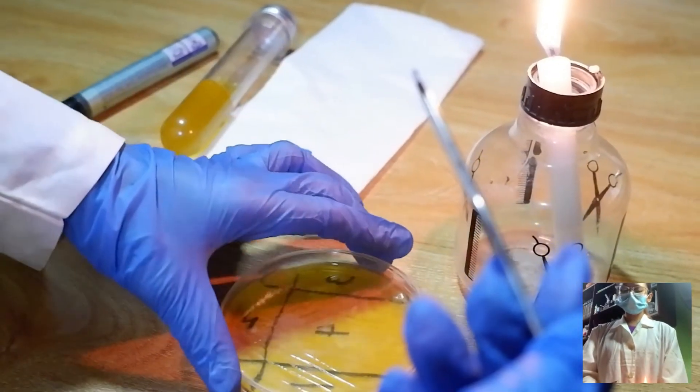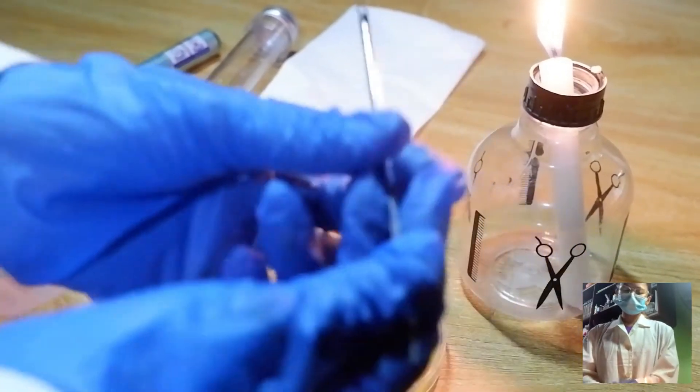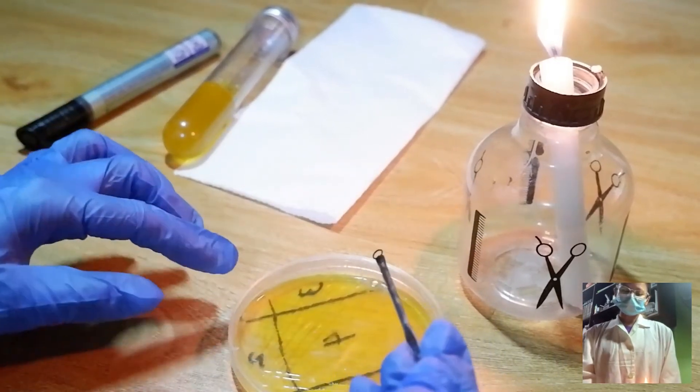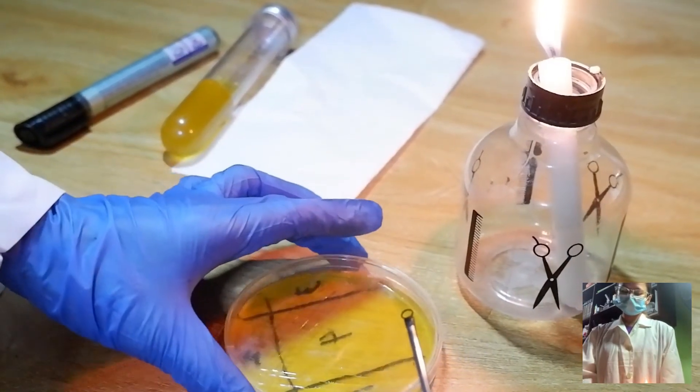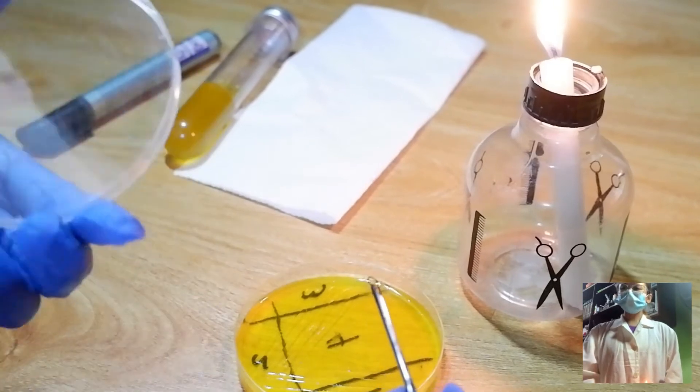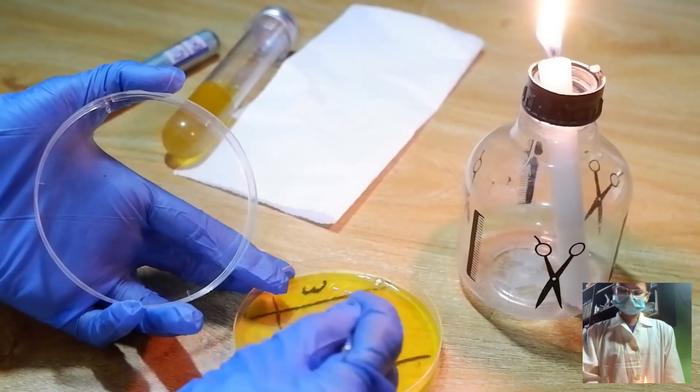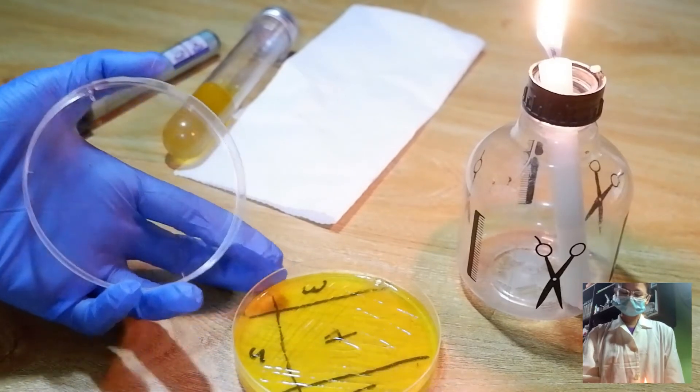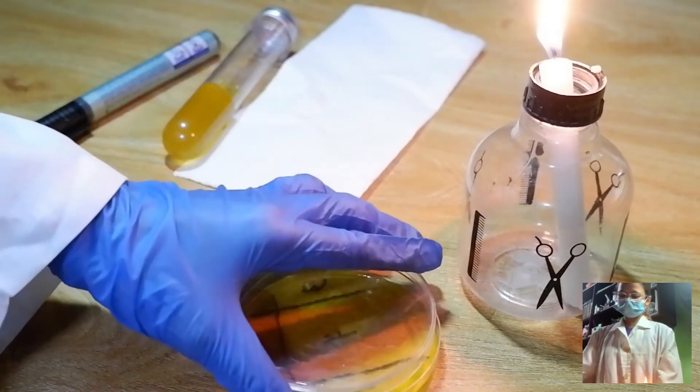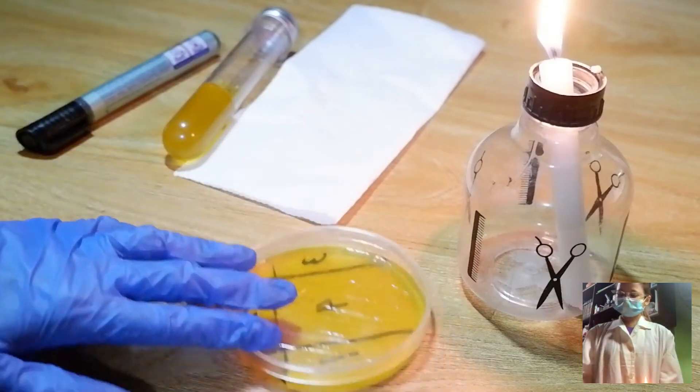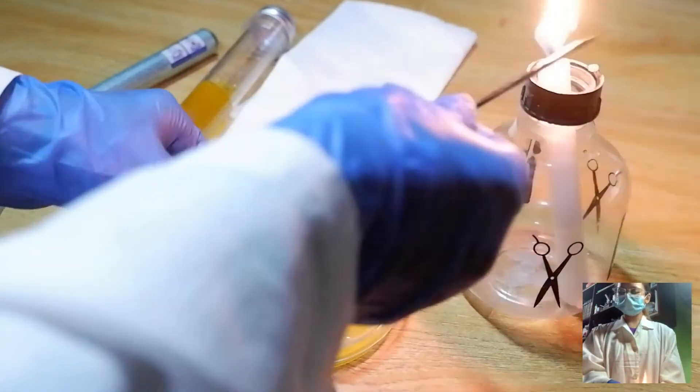So, when it has cooled down, we will now streak from quadrant 3 to 4, as many streaks as we can. And flame the loop again to sterilize.